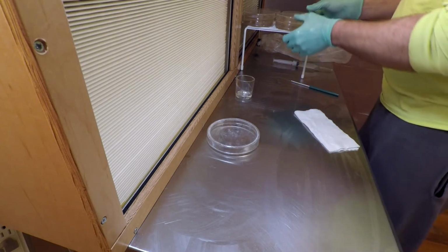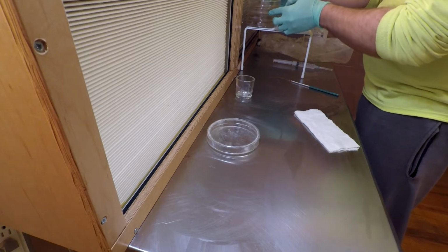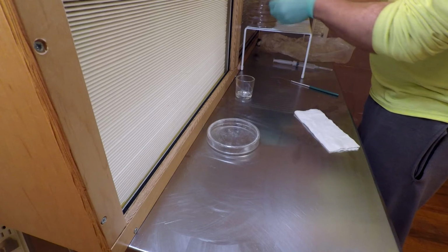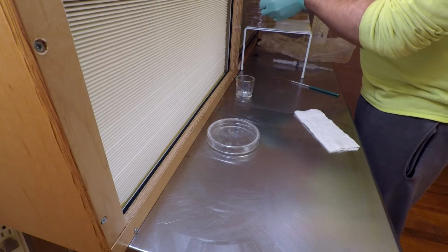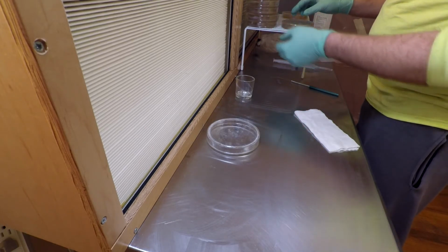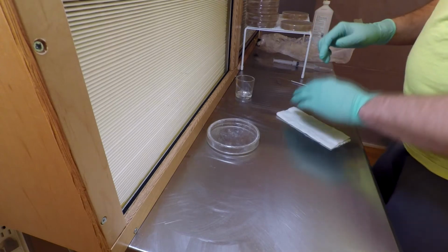Alright, so I can stack some of these out of the way. We got some more room. You always want some sort of system to make sure you're not skipping dishes or double inoculating dishes, although you can easily see once you streak through the agar whether or not you already inoculated.